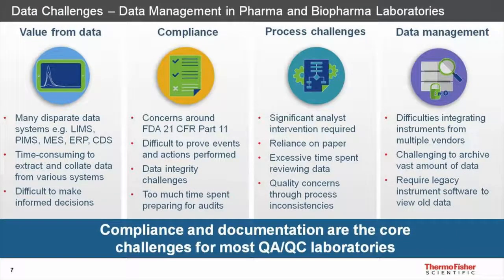Data management. Outside of chromatography data sources, maybe you have FTIR, NMR, legacy chromatography data systems that aren't even supported anymore by other vendors. When you're trying to pull all that data from different sources, whether it's the CDS, LIMS, any of those other acronyms, resource planning, manufacturing execution systems, you run into a really time-consuming activity where people might be pulling data.